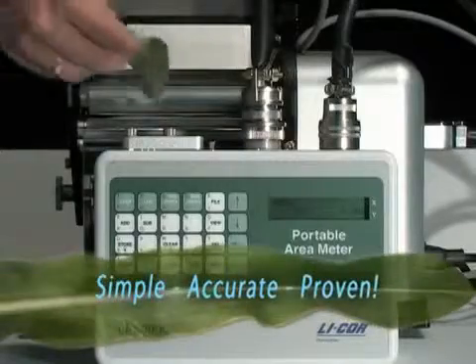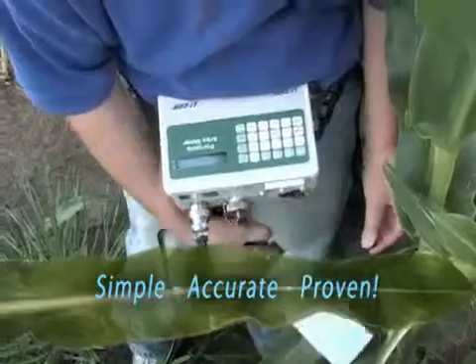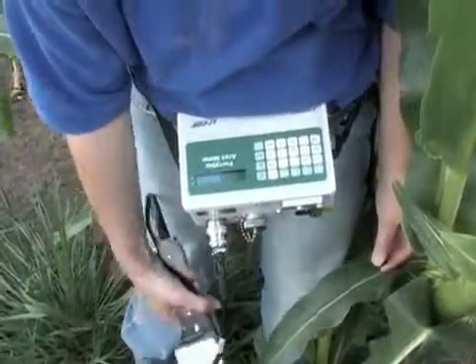Choosing the LI-3000C will save you time and money and become an important research and educational tool in your laboratory.